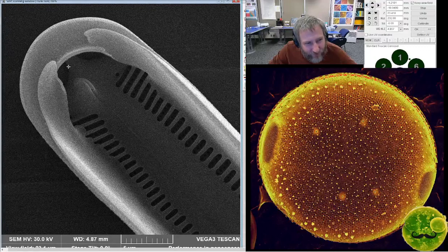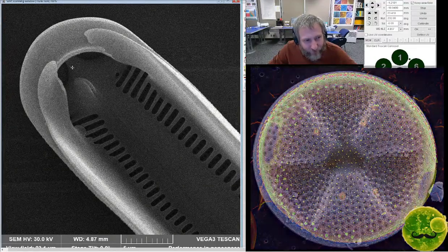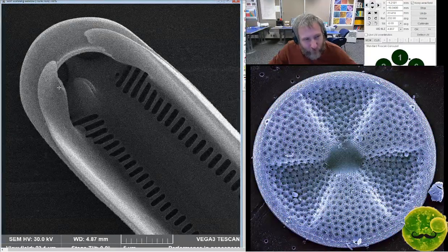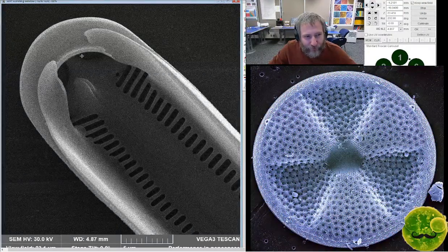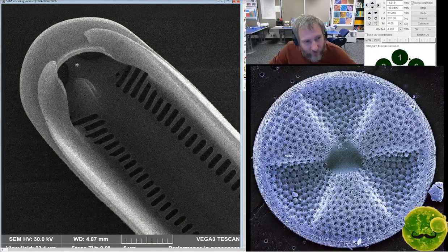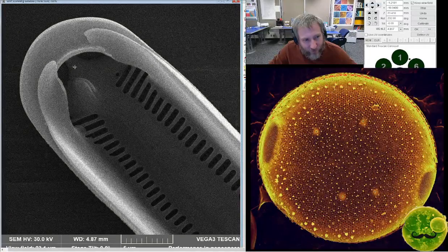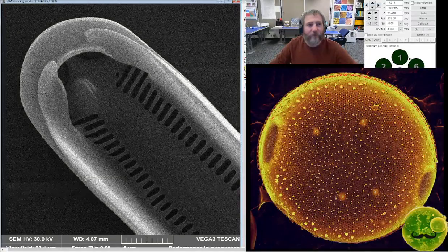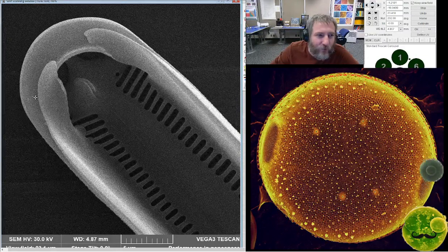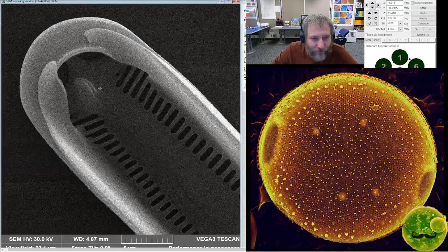And these little vent-like things up here are the foot pole, the apical pore fields. And the raphe on the outside splits those, which is why there's a little bit of silica here. So while on the inside it ends here, on the outside it continues right through that pathway. You can see some of the little holes from the apical pore field. They wrap all the way around the outside edge.